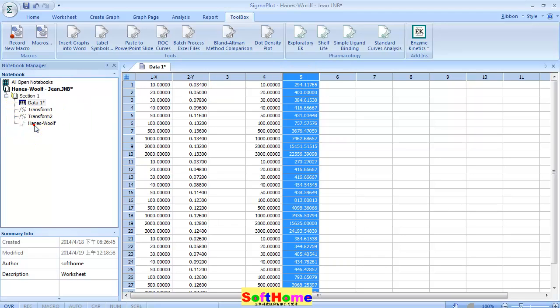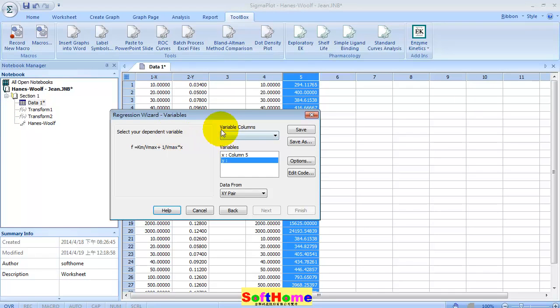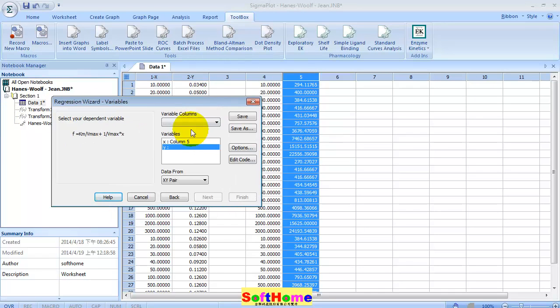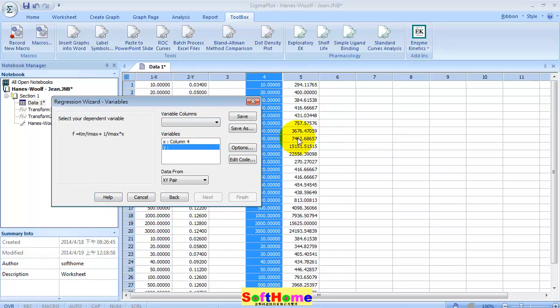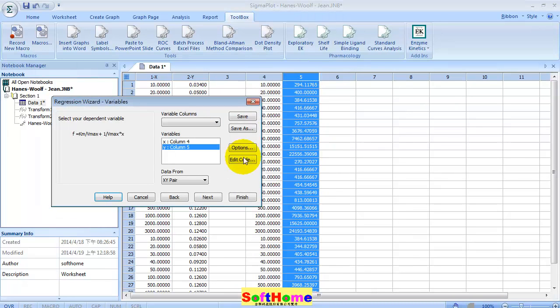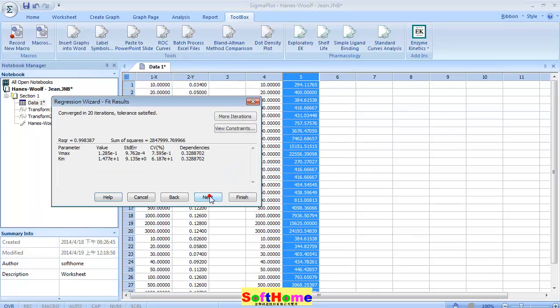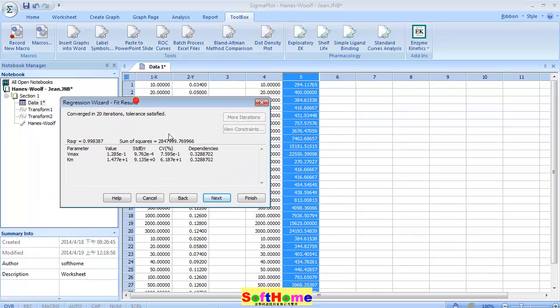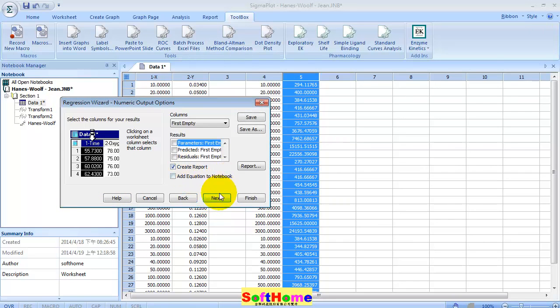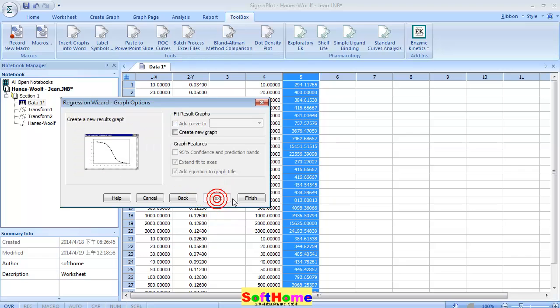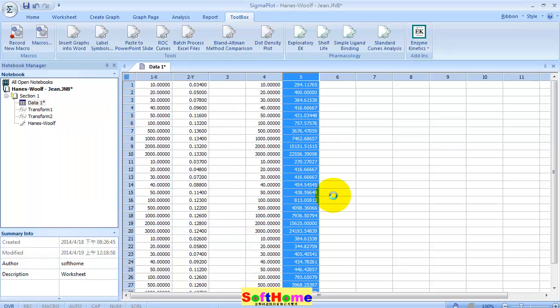Use the user-defined regression. Now it's column four for X, column five for Y. Press next. See the result. Create report.